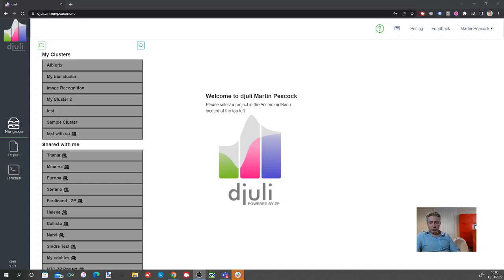But we have a system called Djuli. Now, Djuli is the world's only scientific cloud database where you can upload and analyze electrochemical data. And you can do that from many sources of data. And what I mean by that is many brands of, let's say, potentiostats, for example.